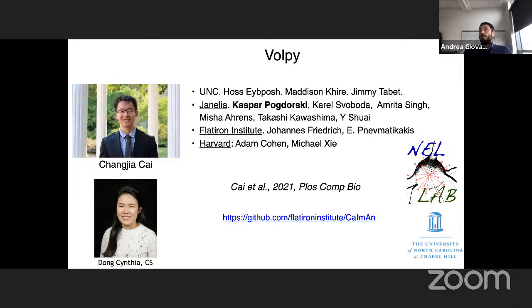We try to develop tools in parallel for the community that can cover different bases. But yes, definitely, it's probably going to be the most important segment of users that needs to be covered in the next years, because it's exploding. It's not like a two-photon imaging setup that costs $200,000. With maybe $10,000, you can establish an experimental platform, and then at that point, your problem is just analyzing data.